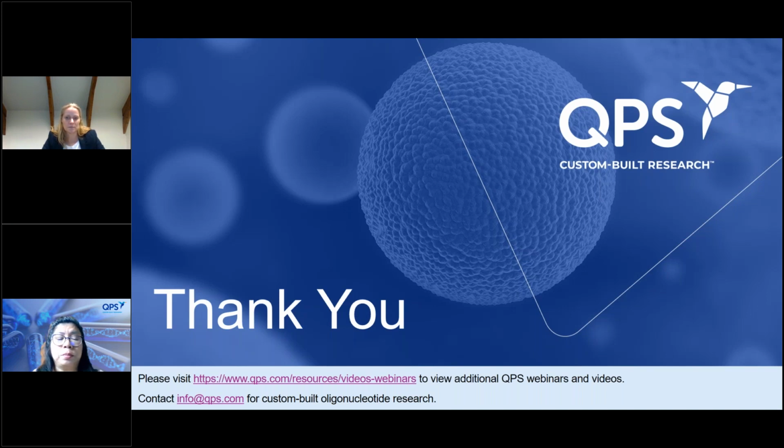And where do people typically get their oligos, and how much time does the probe design and procurement add to the overall method development timeline? So there are a lot of good companies out there that can synthesize the oligonucleotides. We have good experience with Eurogentec. What I like about those guys is that if you have a question or you're not quite sure if your probe design is the best way forward, they're very patient with you and help you with that. And I think that should be key: find a company that synthesizes your probe that really thinks with you instead of not helping you. So yeah, we have good experience with that.